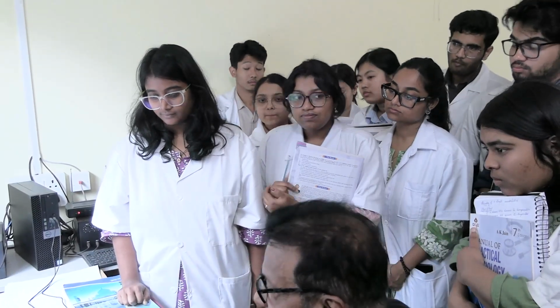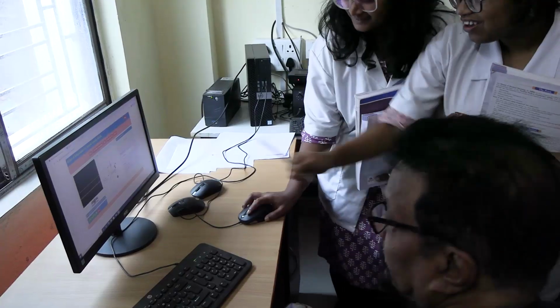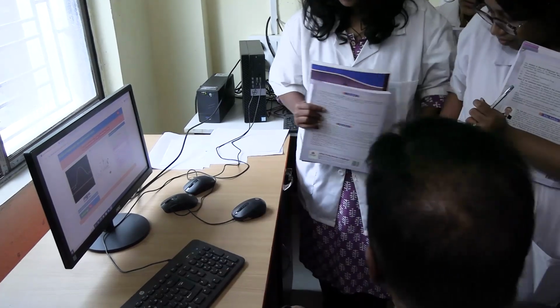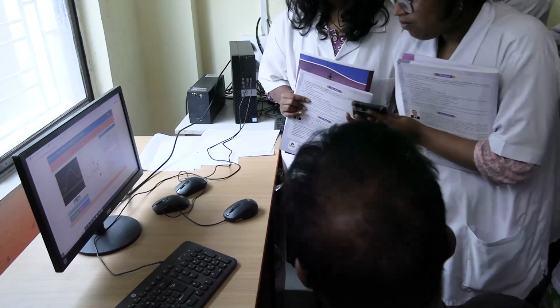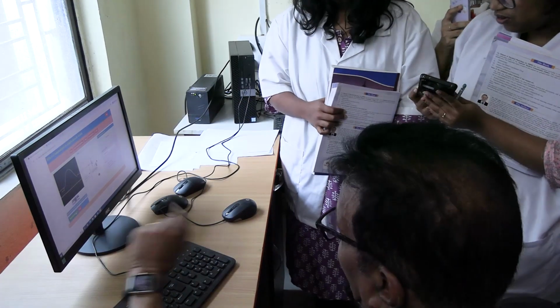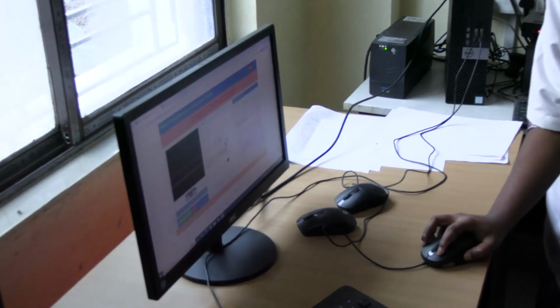Okay? Fine. Now let us do the experiment with normal ringer. So you just start, record. Okay? So done. Get a photo of this. So this is with normal ringer. Now you change it to hot. Okay.